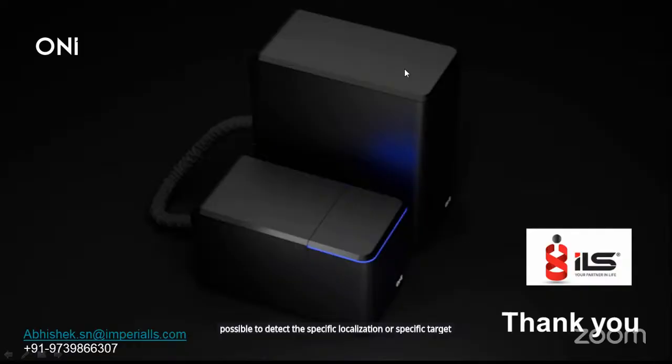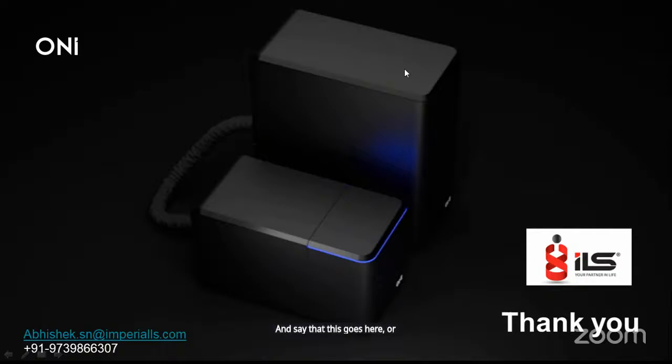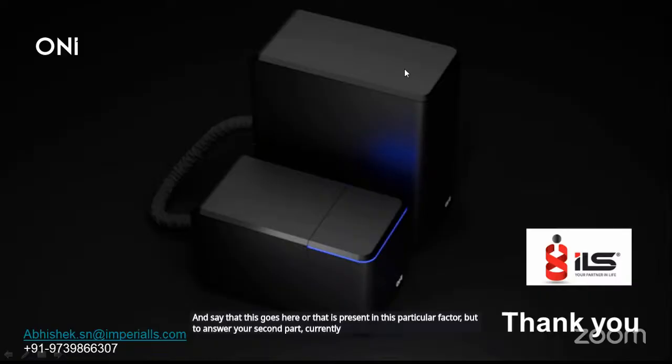To answer the question, yes, you can do it. It is a comprehensive experimental flow that you have to design, because you want to look at multiple organelles or factors to rule things out. You have to design multiple experiments to rule out and say that it goes here or is present in this particular factor. But to answer your second part, currently we are not outsourcing it. We only do the CapEx, so we just sell the instrument. We don't do any outsourcing currently.